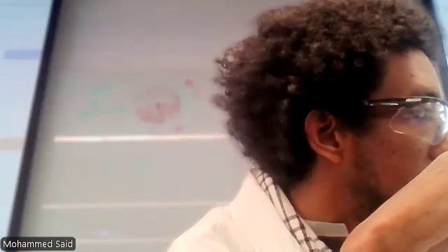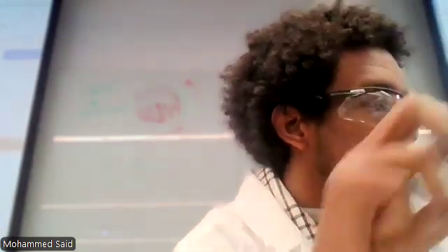So you have as a group under 15 minutes, actually we'll say 13 minutes, to complete this final stage of the plaque assay. So likely most of you, oh, by the way, what did you put inside there? Nothing? Okay, you opened it, okay.